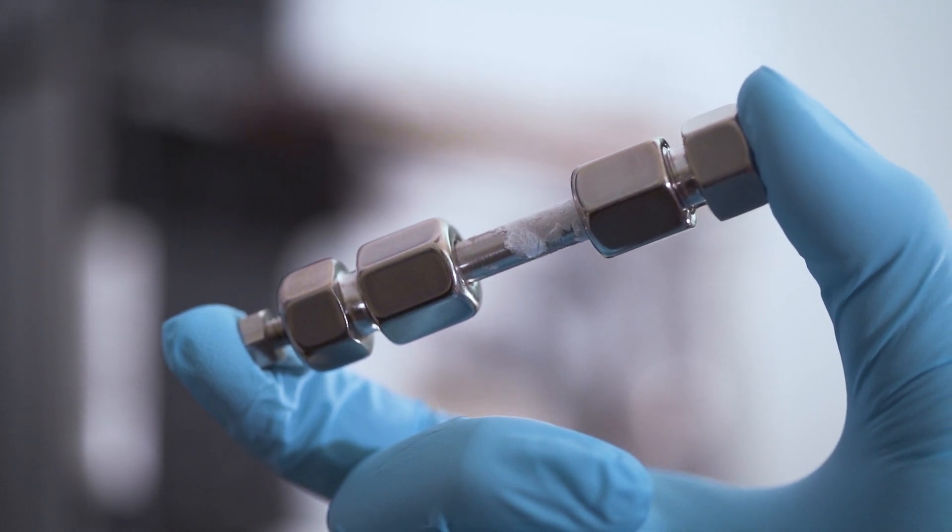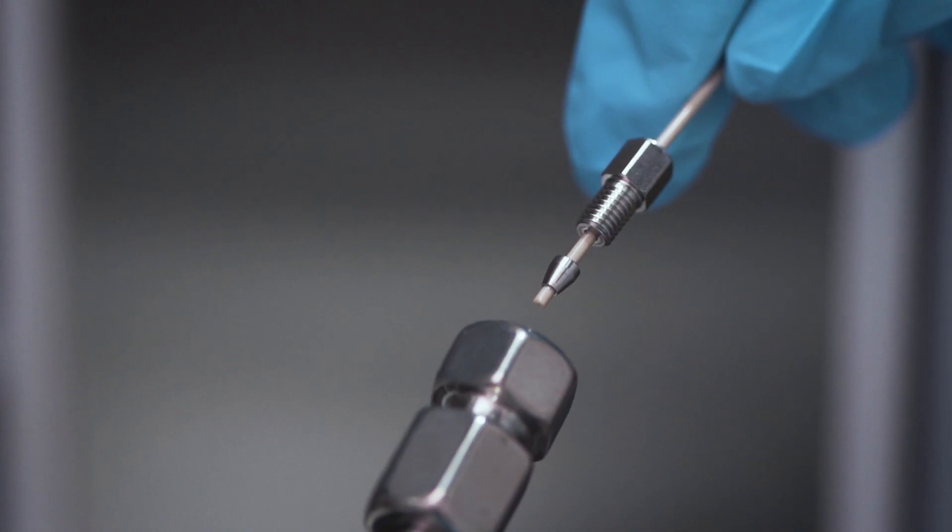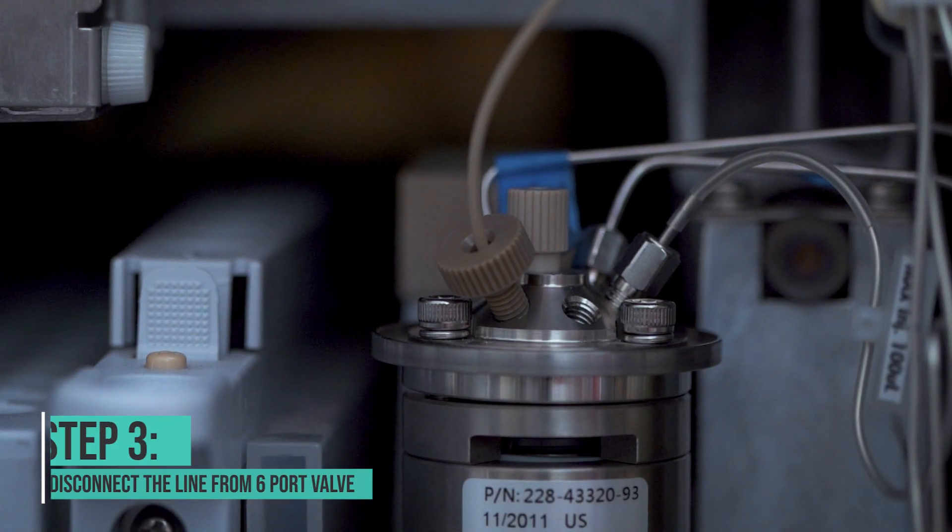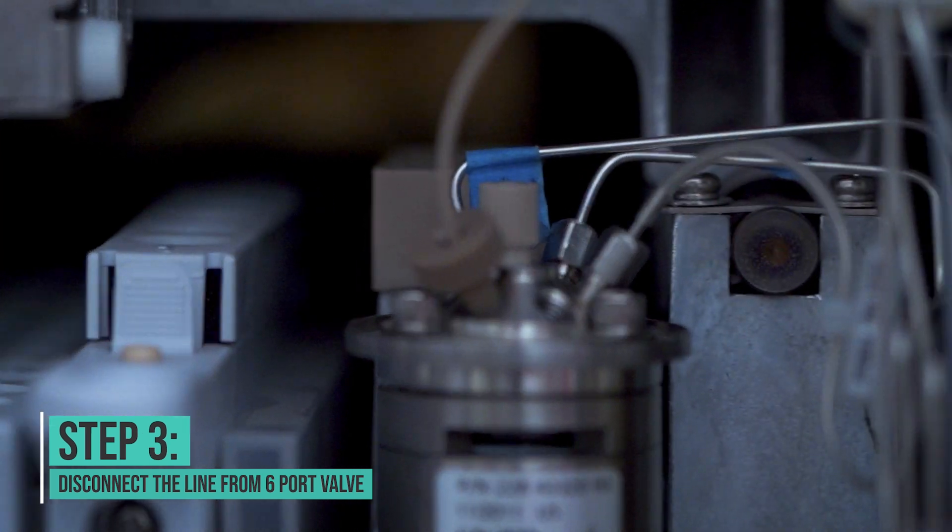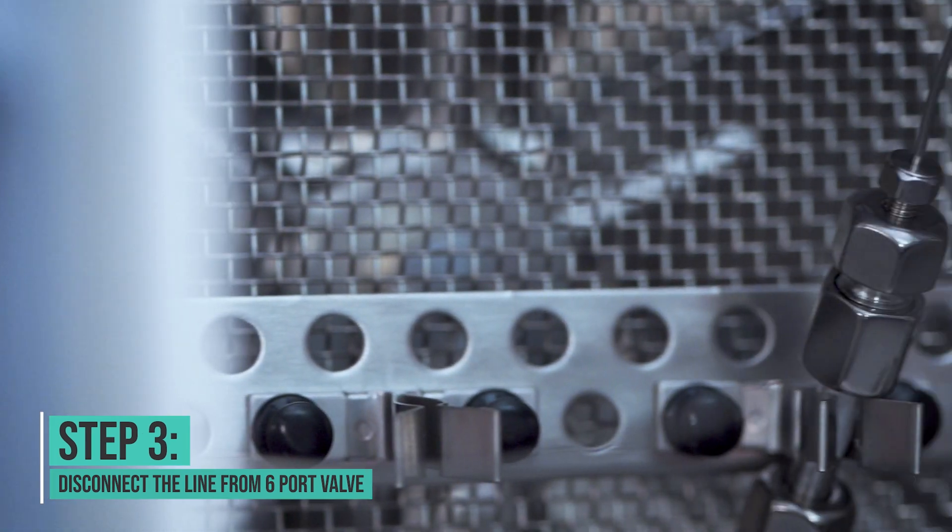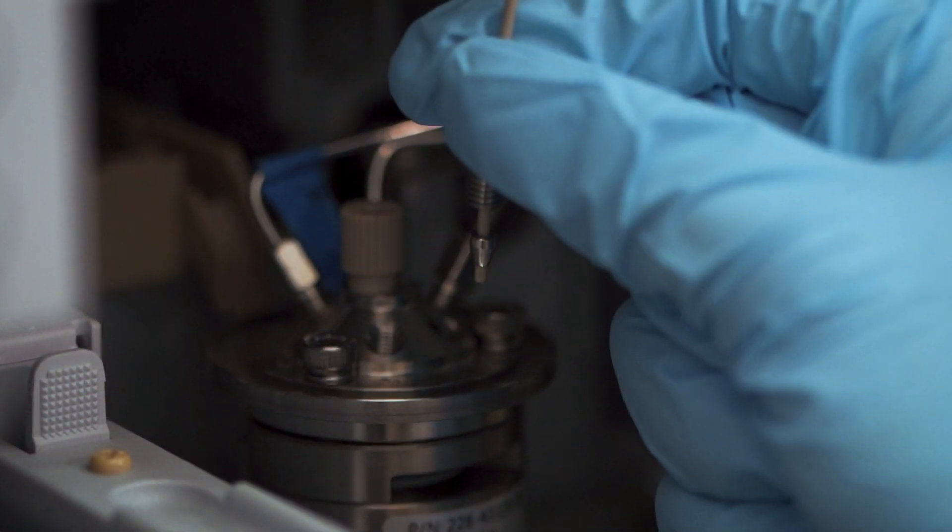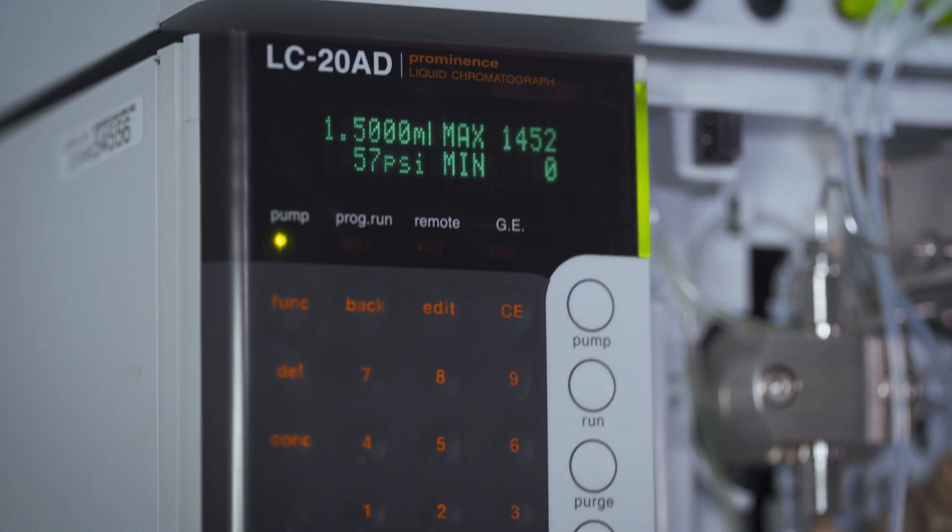If you disconnect the column and your pressure is still high, another very common culprit is the line going from the six port valve into the column. Disconnect that and see if the pressure goes down.